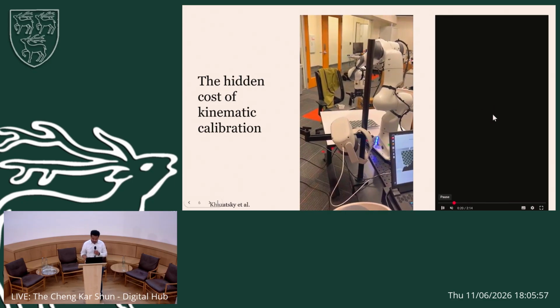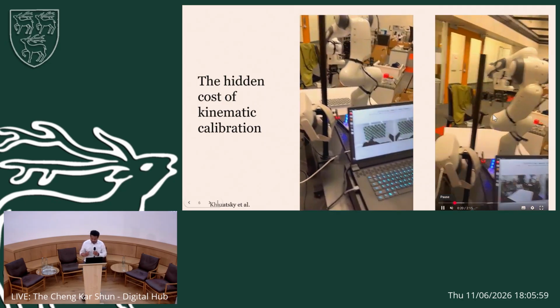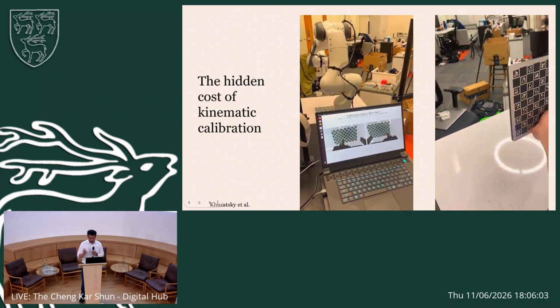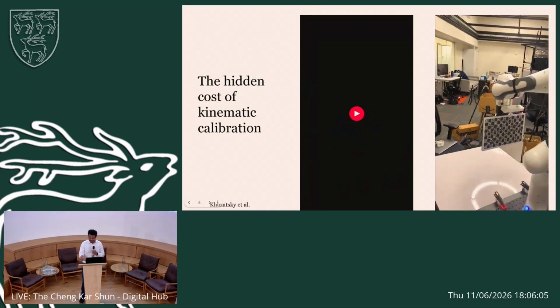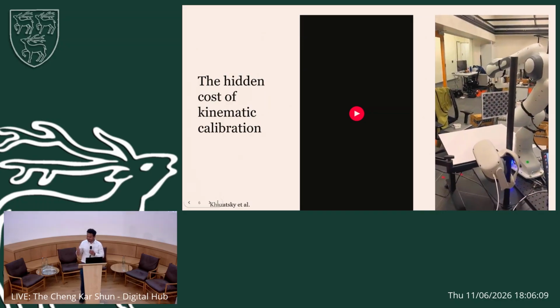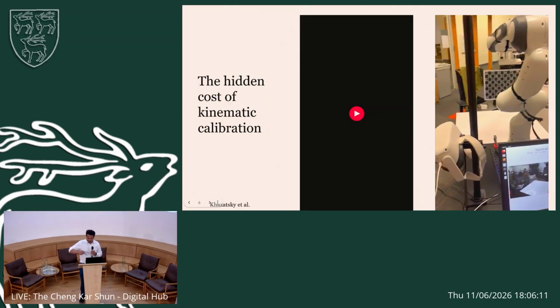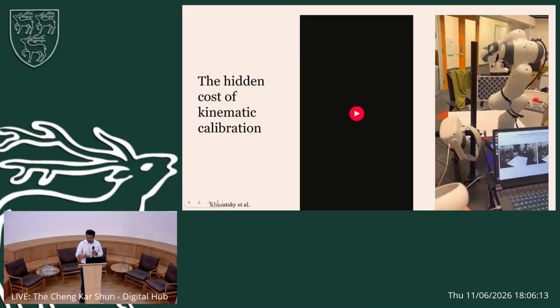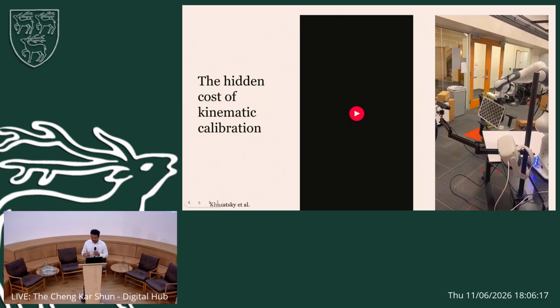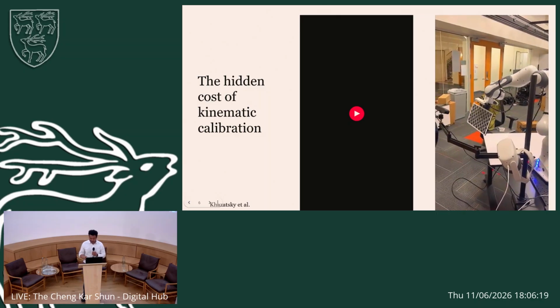And on the right, we see a more tedious task of having a bespoke gripper that's able to mount this calibration target, and then a user manually brings this target around the external camera in order to understand the mapping from the external camera to the robot arm. So that creates that correspondence.